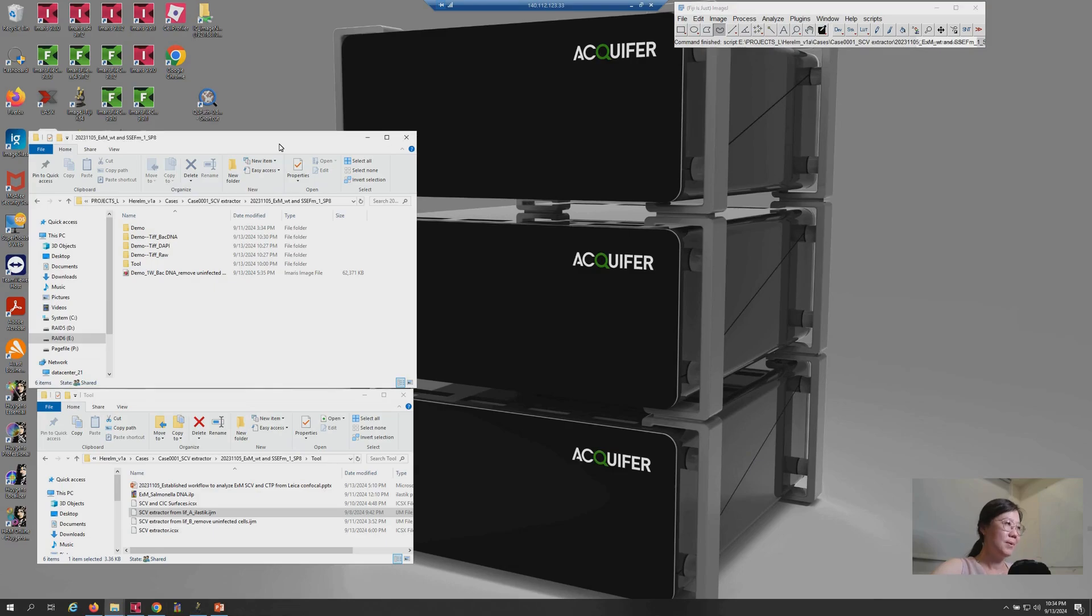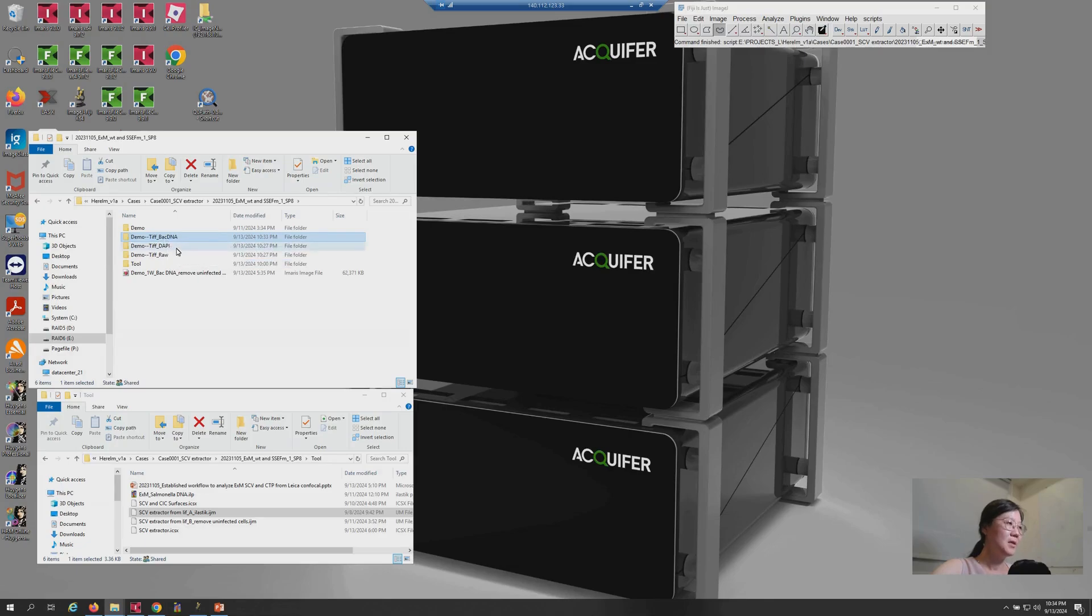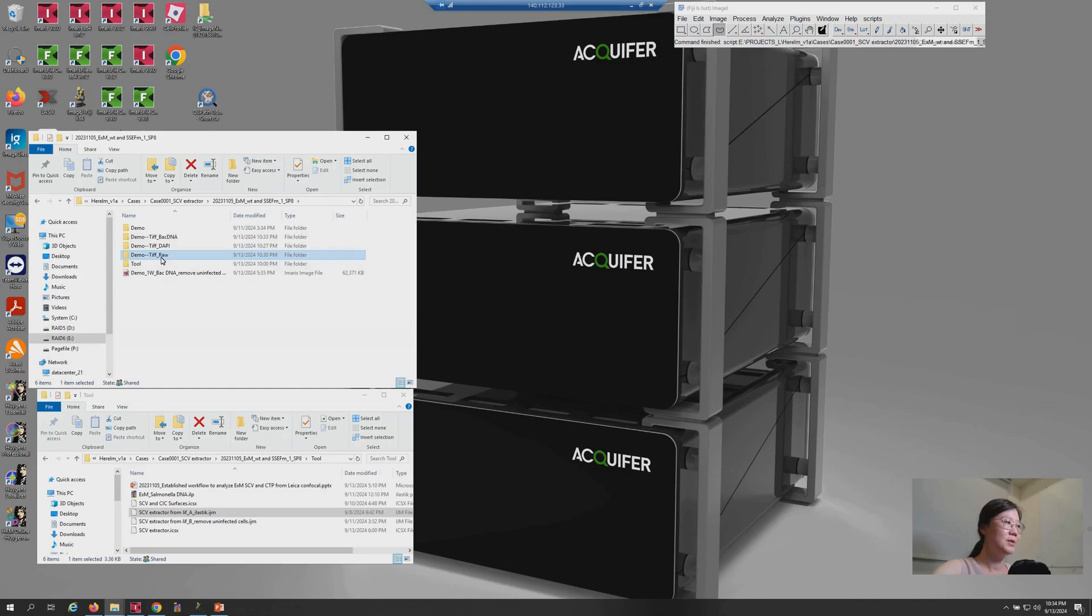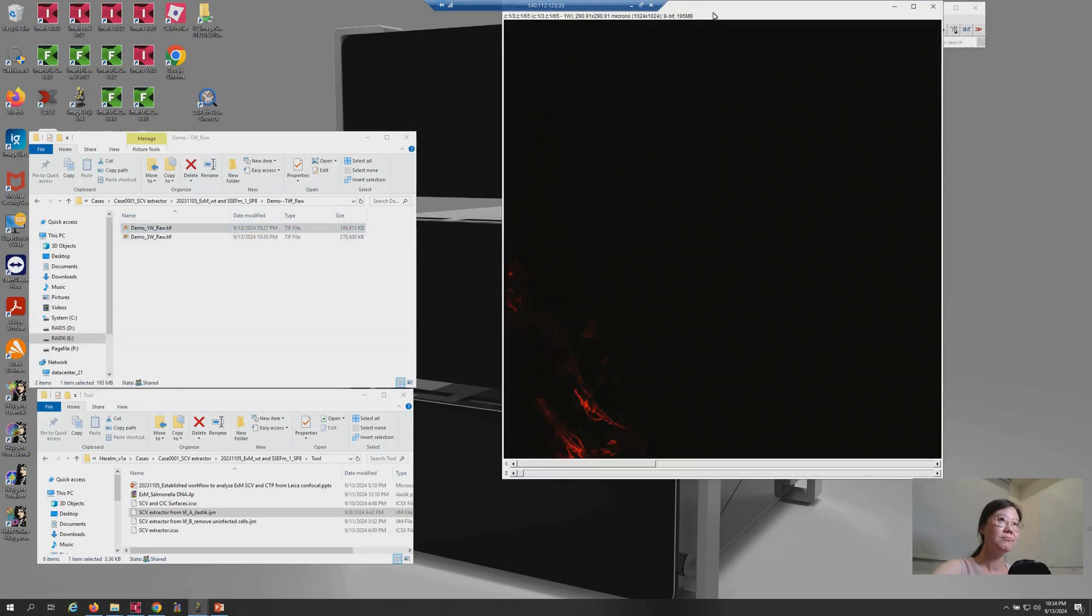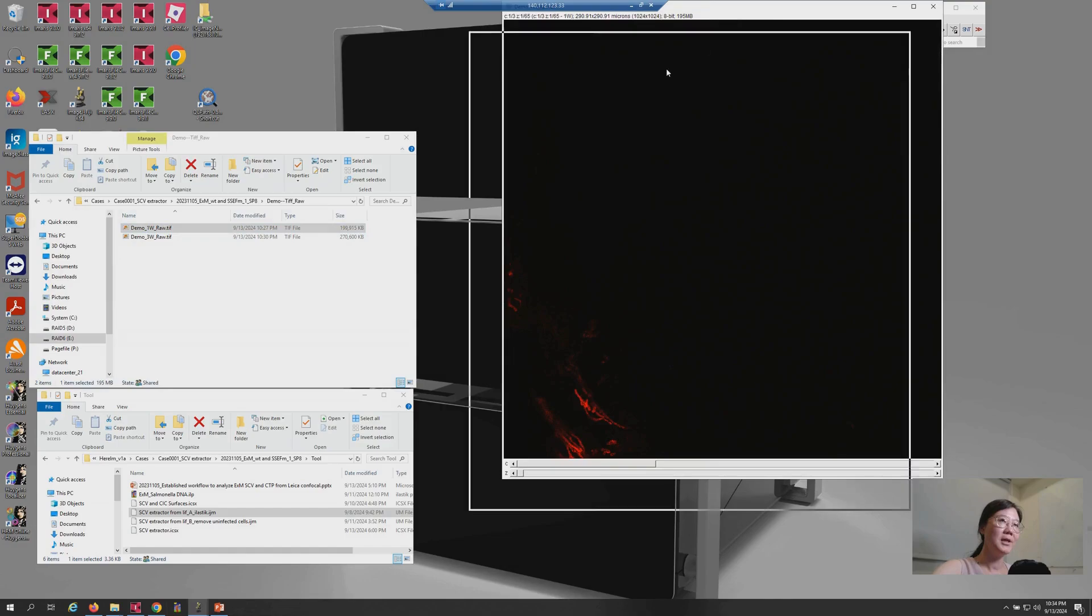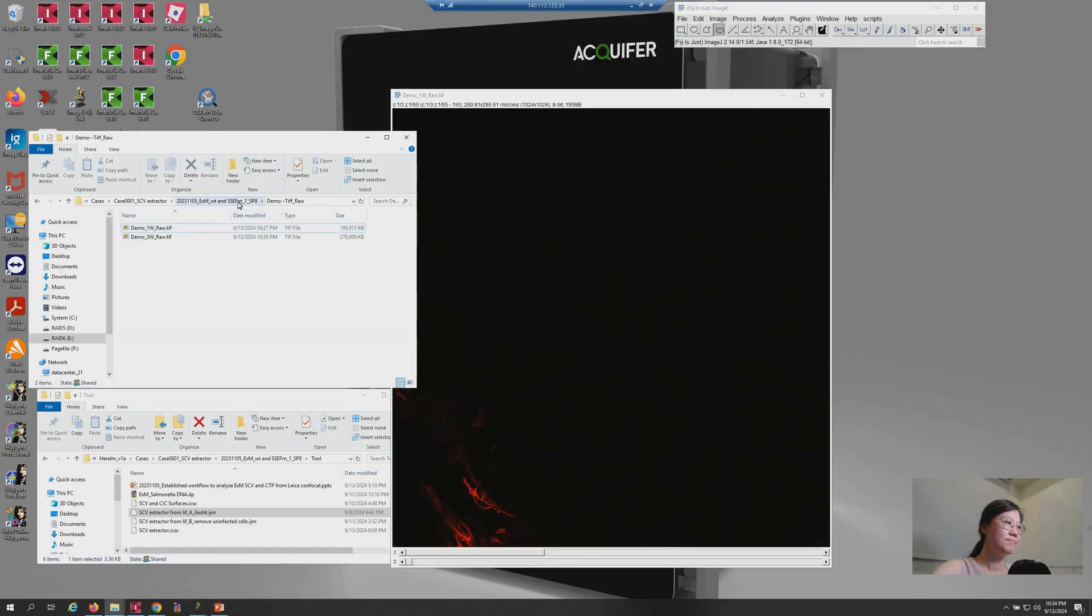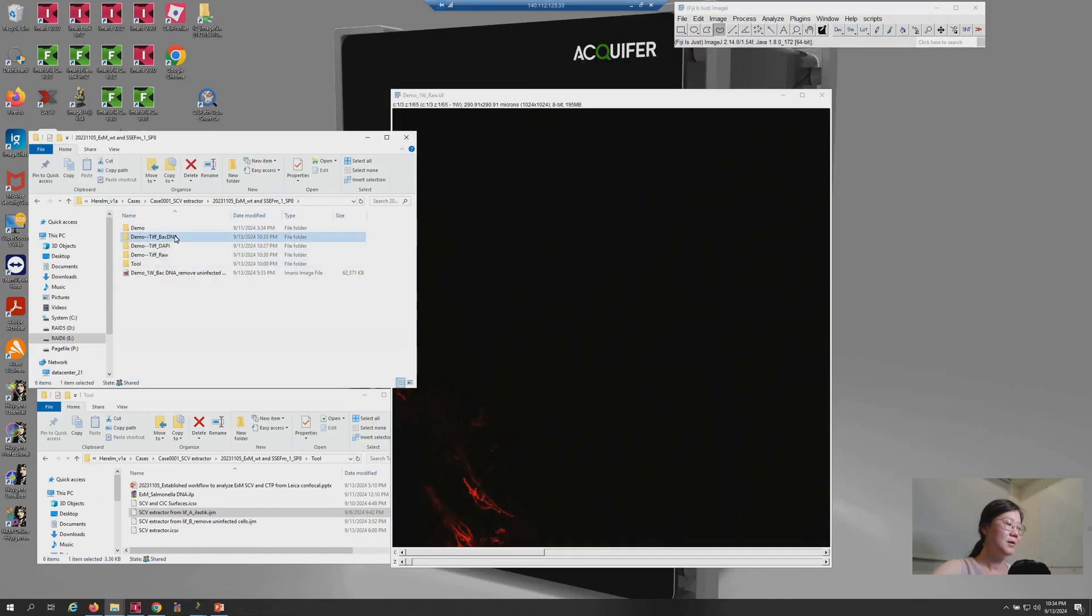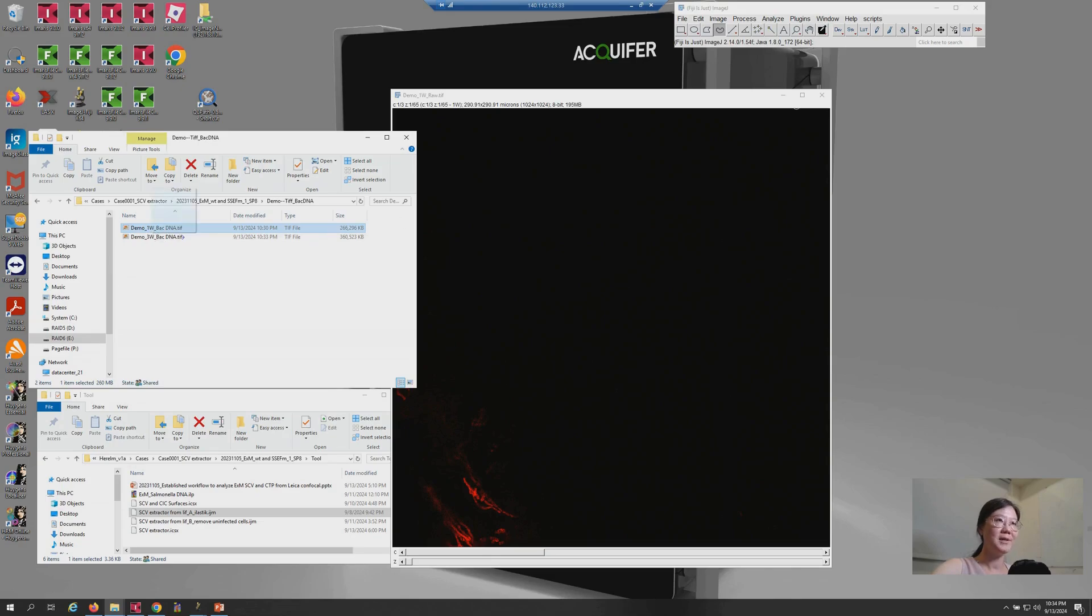Let's check the result first. Under the parent folder, you will see there are three additional folders being generated. The most important one is this, named TIFF-back-DNA. So, let's go to raw data or raw folder to open one of the raw images. Here's the raw image. And here is the processed result. So, we open the image with the same file name.